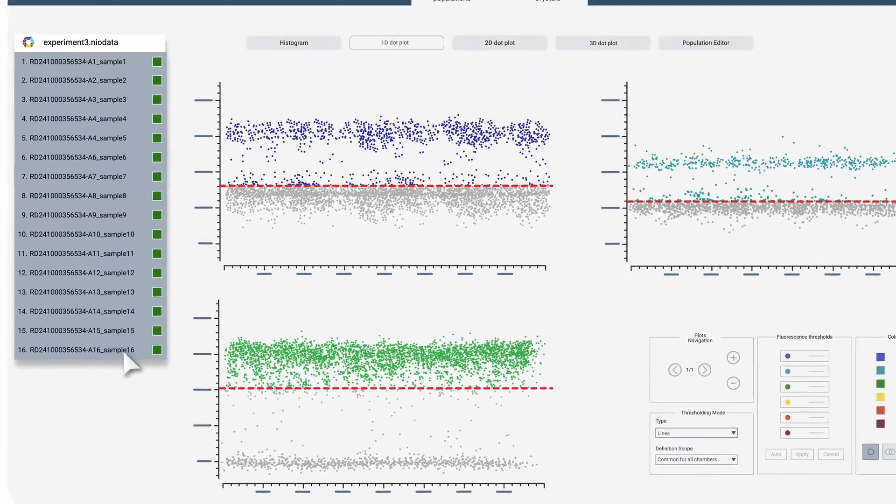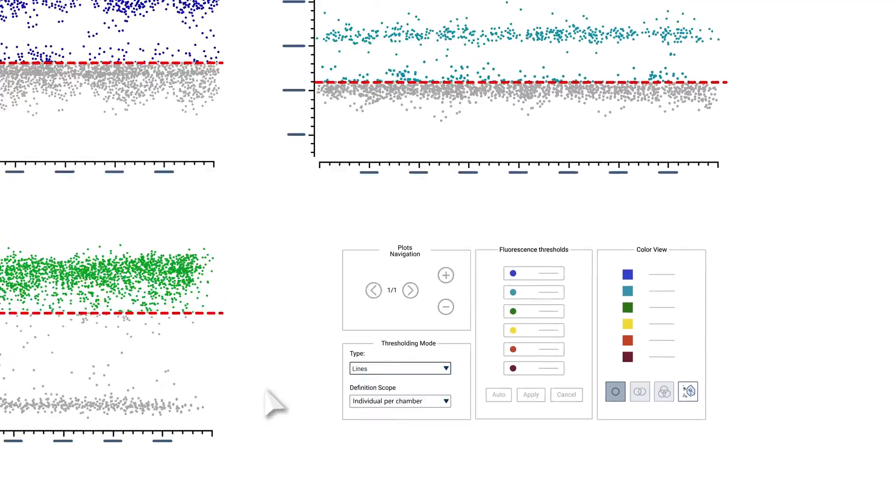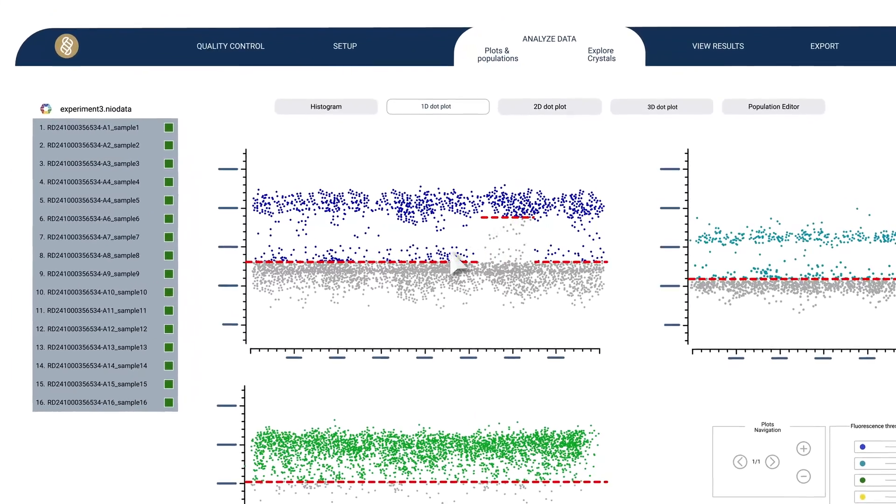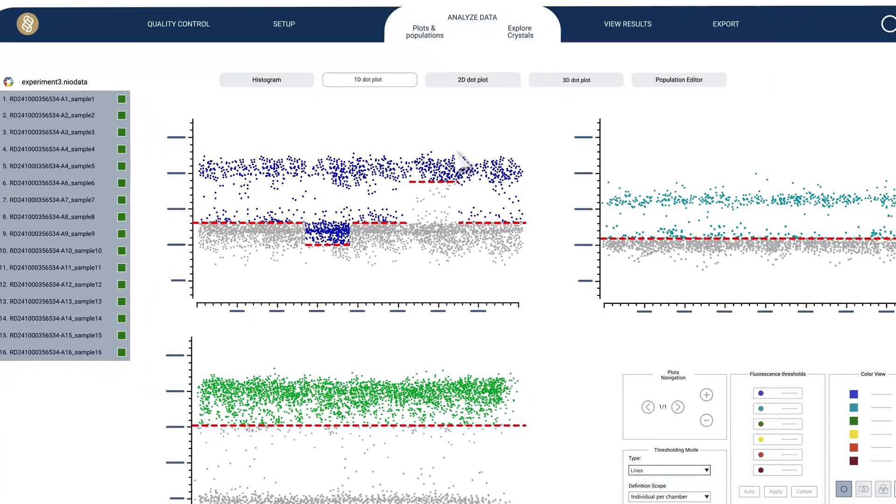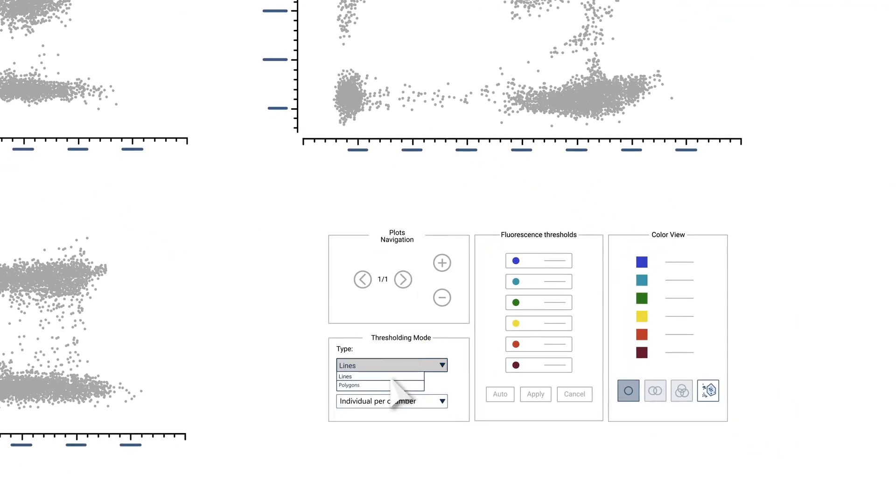You can control populations with automated thresholding, manual thresholding, or draw up your own polygons to create custom populations.